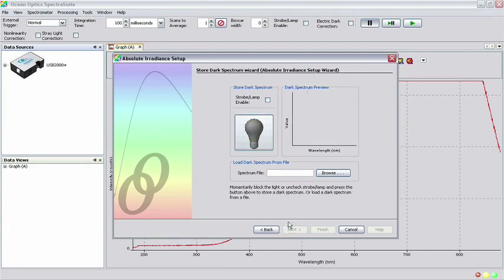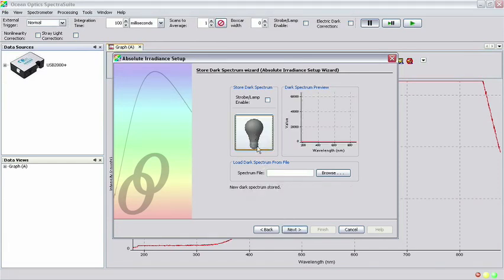Blocking the path of the light source, click the gray light bulb button to store the dark spectrum and click Next.